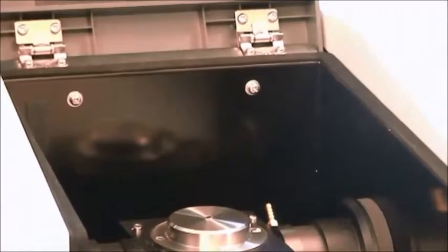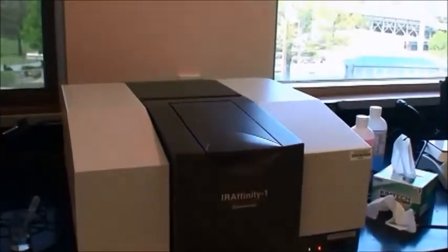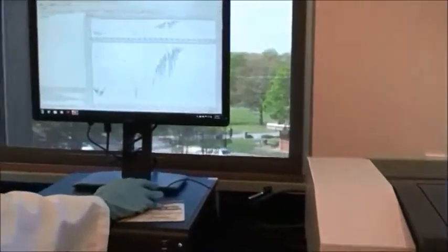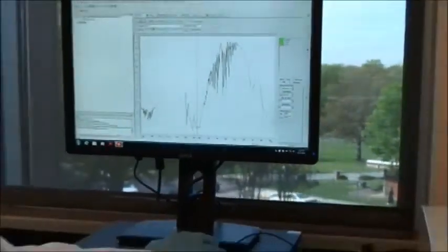All right, just a real tiny bit. We're going to close our compartment. Come back. So our screen is press measure. And you can go ahead.